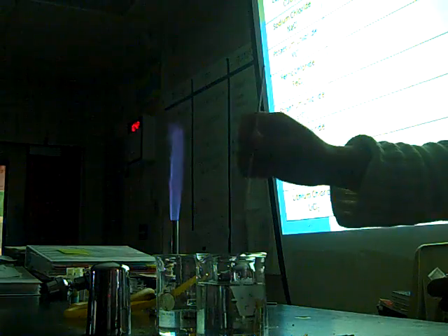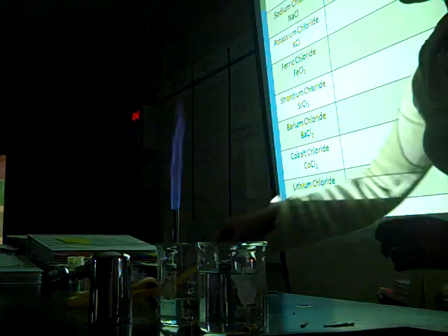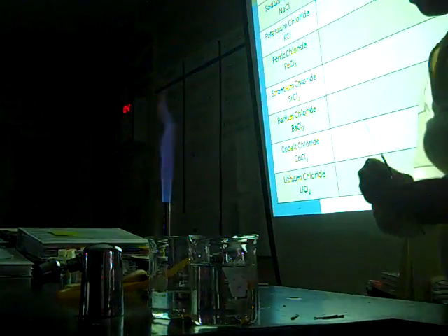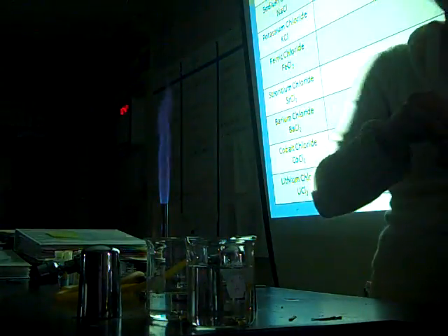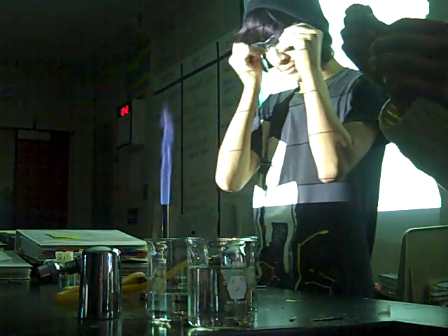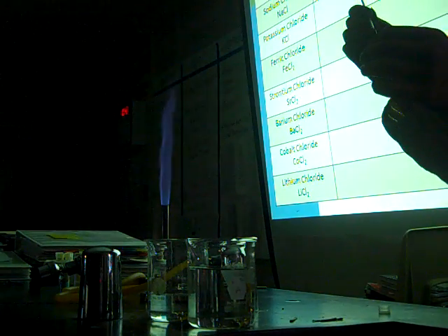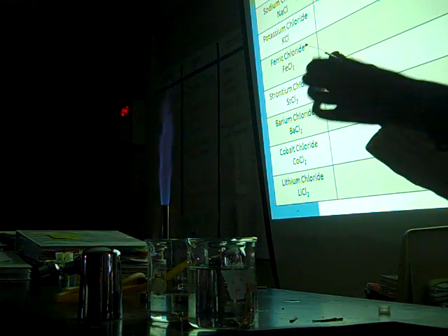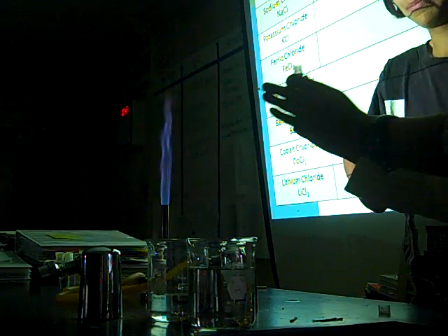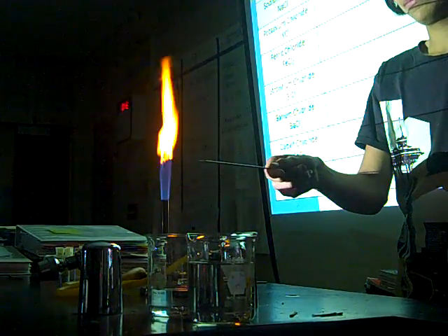All right. Barium chloride. Let's see. Oh, Nick, your hand's been up for a bit. Come on up. Whoa. You scared me. All right. I want to do lithium. All right. Barium. No, you can't do lithium. All right. She gets to do lithium. I can do a lithium. Okay. All right, Nick. Nick, what do you see about barium chloride? It's white. It's white? Okay. So you got a little crystal in there so try not to knock it off.